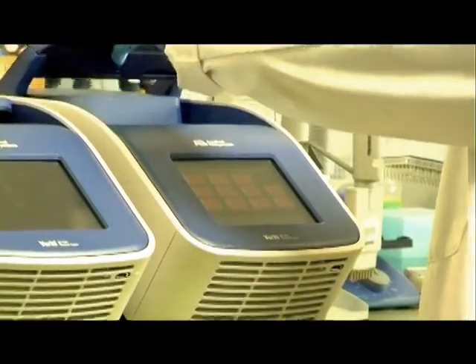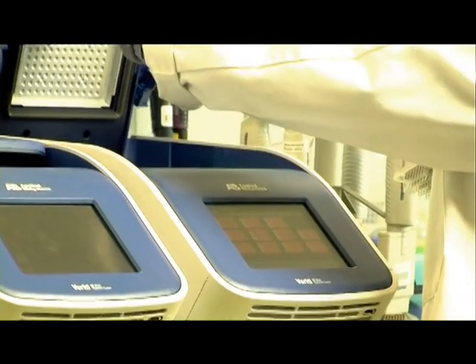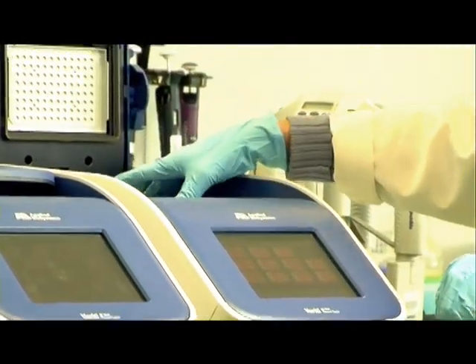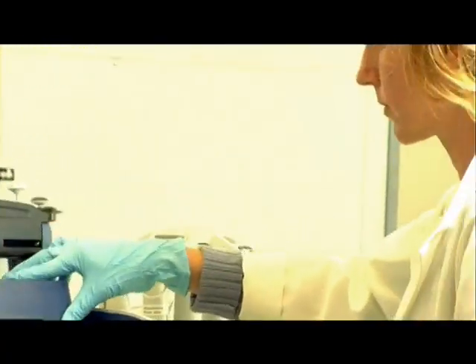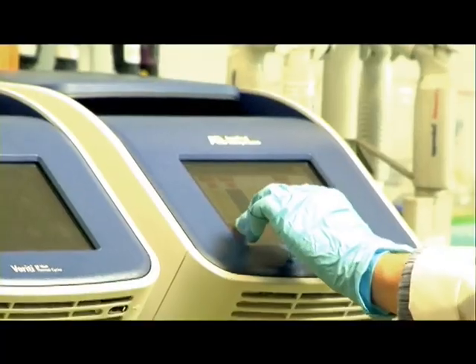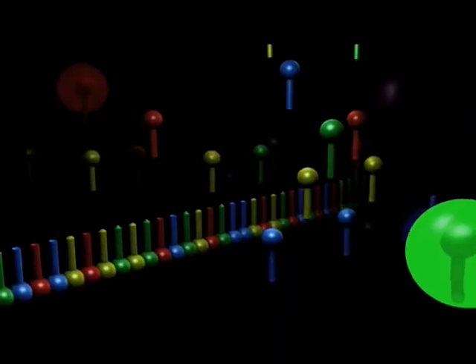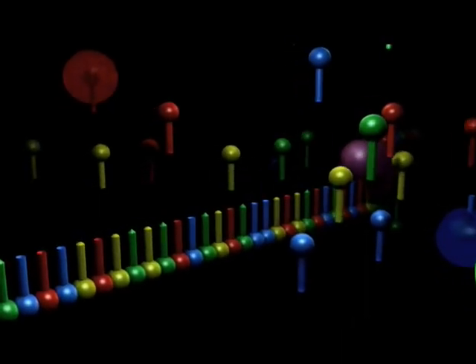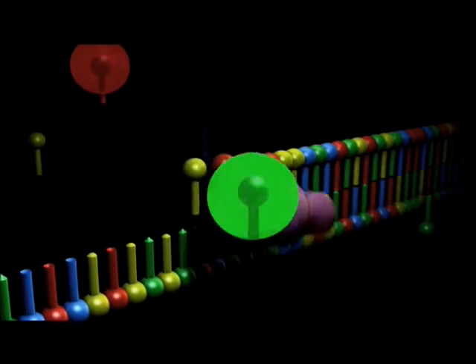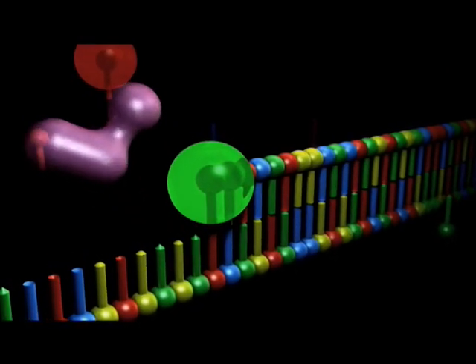The plate is then placed in a thermal cycler where the fluorescently labelled products are produced. This is a process very like PCR: the double-stranded PCR product is denatured and becomes single-stranded at 95 degrees. After cooling to 50 degrees, the primer anneals to its complementary sequence. When the temperature is raised to 60 degrees, extension occurs. The important aspect of Sanger sequencing is chain termination with dideoxynucleotide triphosphate terminators, or ddNTPs. The ddNTP terminators have the 3' hydroxyl group of carbon-3 of the sugar molecule removed. Inclusion of a ddNTP terminator stops sequence extension.